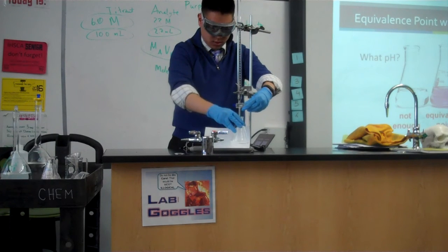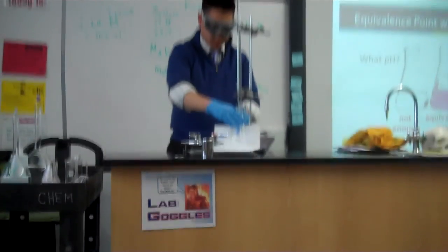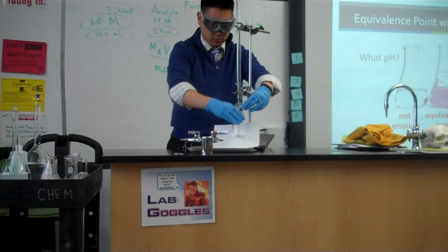All right, so we're going to keep adding drop by drop. See the pink appearing and disappearing? Yeah. Good. This is exactly what we want to see.